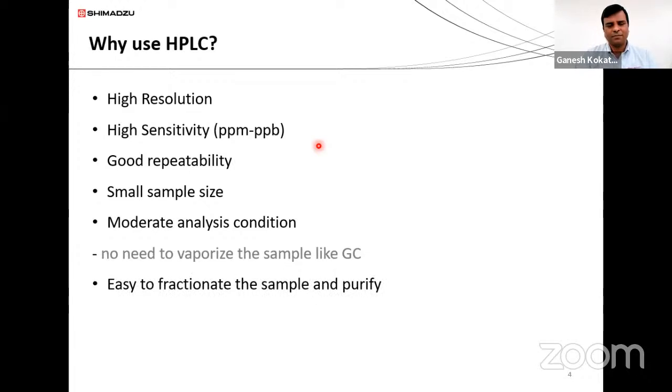And fractionation is also possible with the help of semi-preparative or analytical columns. When you are loading analytical samples, for example 100 ppm or maybe 500 ppm, at that time we are also able to fractionate the sample and purify a very small quantity. I'm not talking about collecting grams or mg, just getting the fraction to identify. And obviously, last but not least, it's non-destructive.